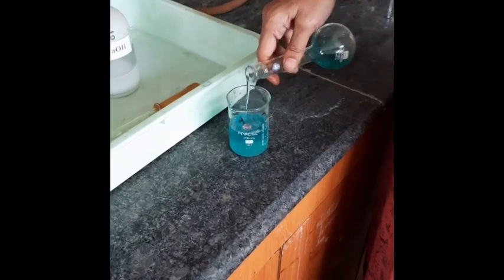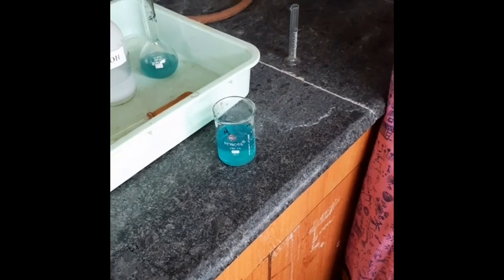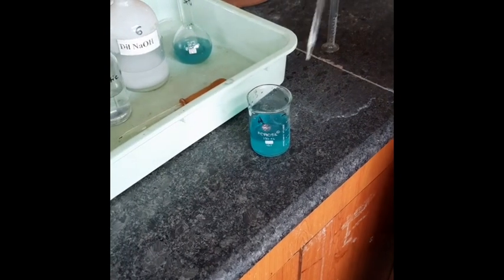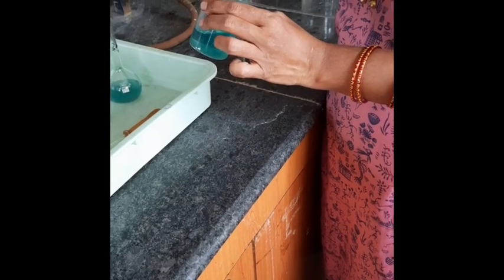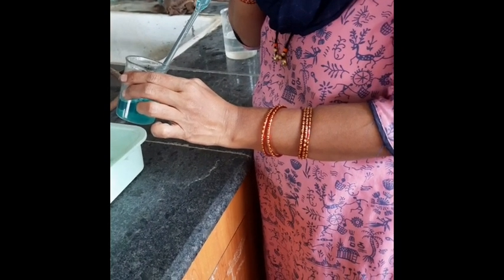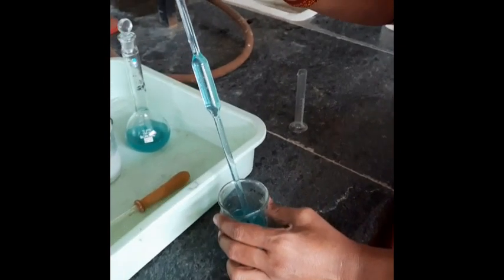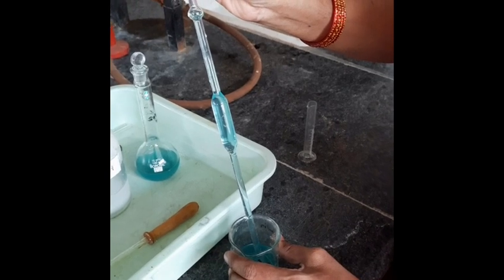Take this prepared sample ore solution in the beaker and pipette out 10 ml of the copper ore solution which we have prepared in part A. Take the 10 ml. Adjust to that marking. Now transfer this 10 ml into the conical flask.